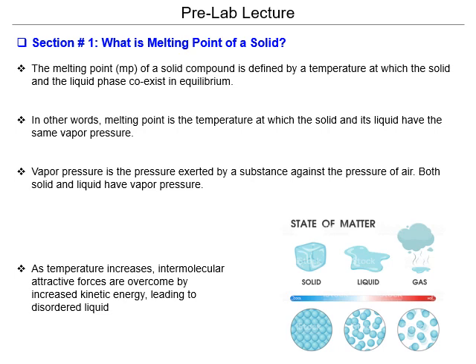Okay, we're going to begin with a quick overview of what melting points of a solid are, and a little bit of talk about the intermolecular forces and what determines vapor pressure. For melting point, we're generally only concerned about a solid, and melting point is the temperature at which the solid and the liquid phase of your substance will exist at equilibrium. In other words, the melting point is the temperature at which the solid and liquid have the same vapor pressure. They're at equilibrium, fighting each other to be solid or liquid, but everything's happy, same temperature, same pressure. And that's considered the melting point.